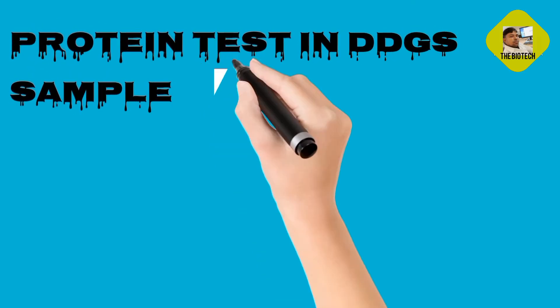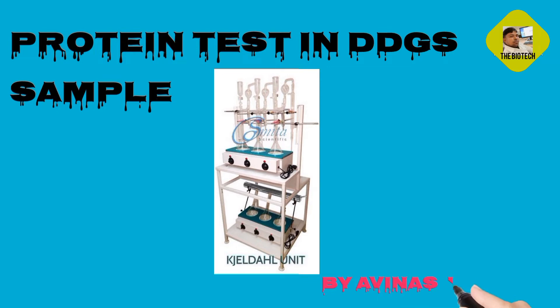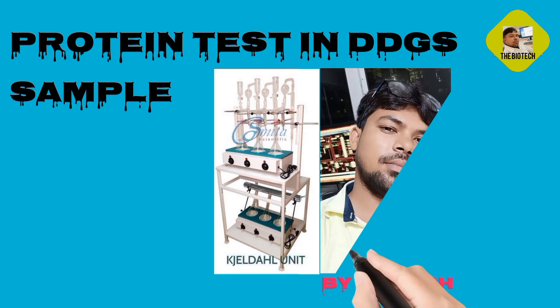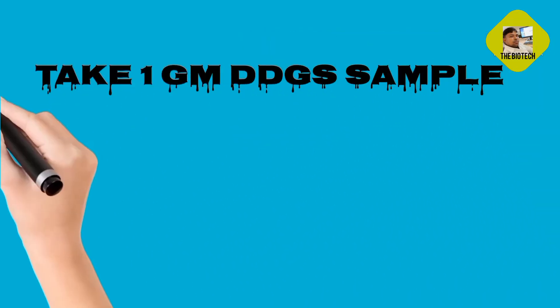Protein Test in DDGS Sample. Take 1 gram DDGS sample.